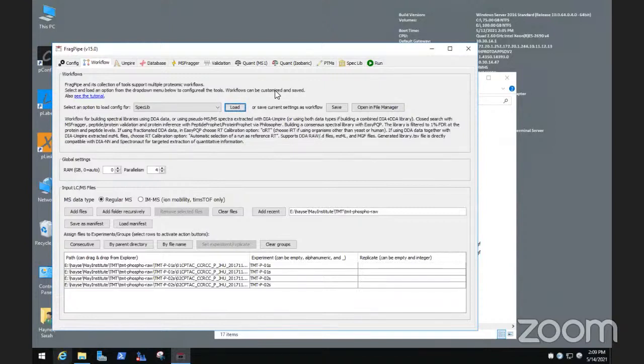So I think it's a good option for Skyline users as well to compare building a library inside Skyline from the search results versus taking the library that we have, because we also have nonlinear retention time alignment already done in there. If it's the diaPASEF data, we have ion mobility aligned as well. So it's something that we'll look into in the future.